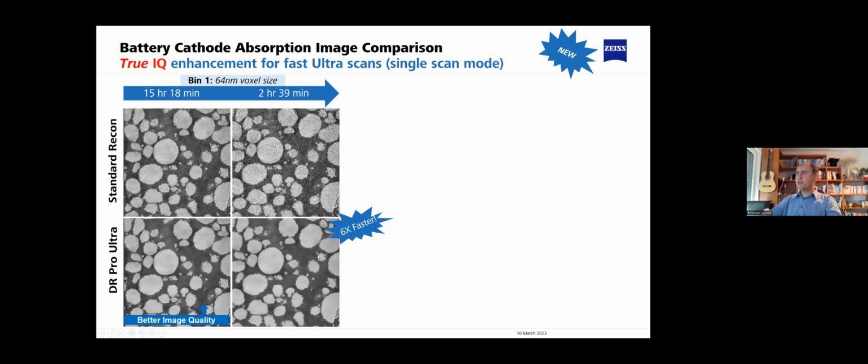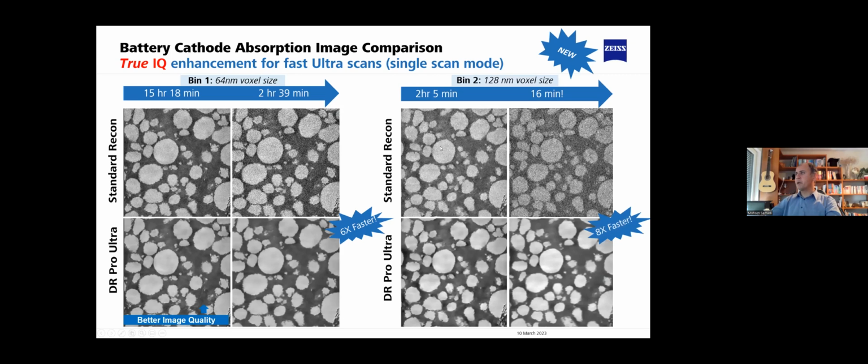Even if, for example, in situ experiments are needed, or for whatever reason we need to go for really short scan times, it is possible to get nice examples of having nice quality within just 16 minutes.